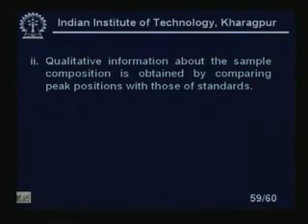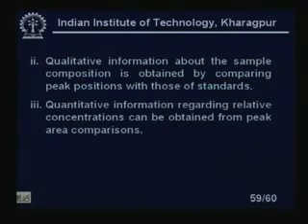Qualitative information about the sample composition is obtained by comparing peak positions with those of the standards. Quantitative information regarding the relative concentrations, this is most important.